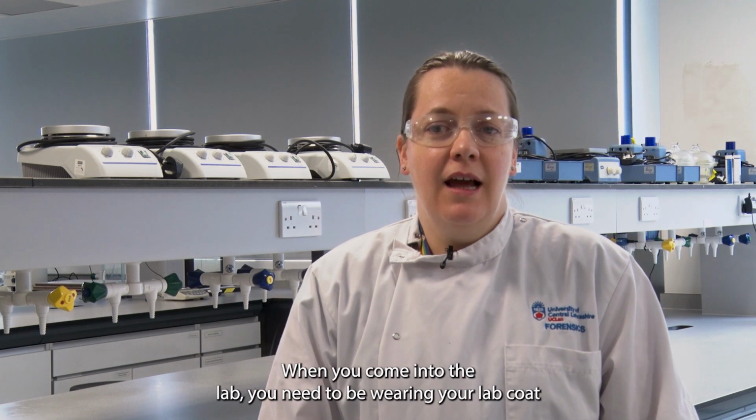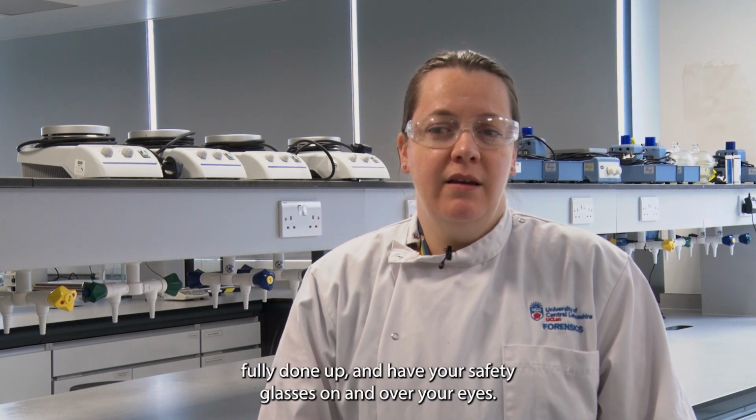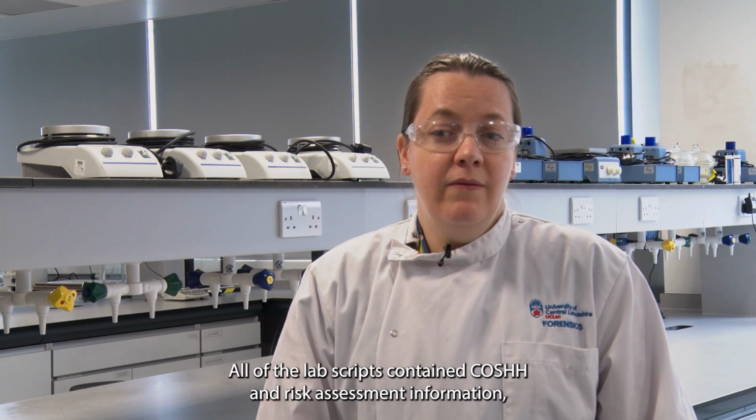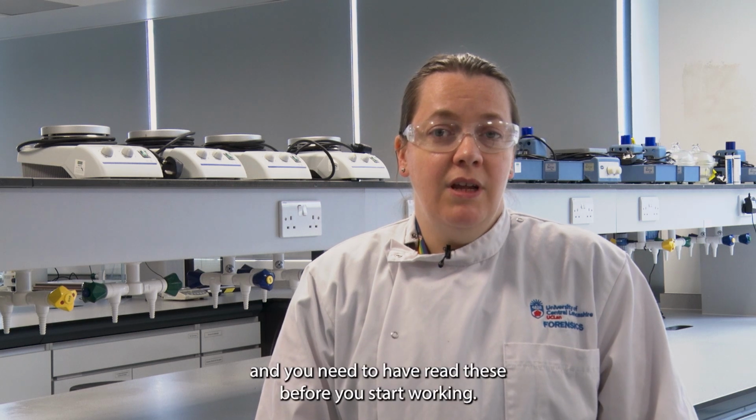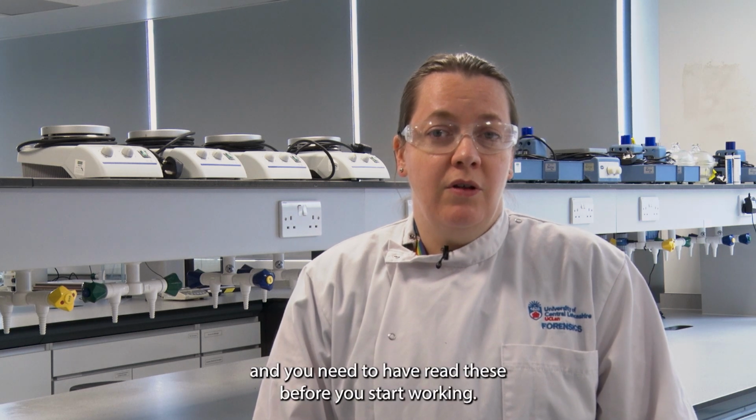When you come into the lab, you need to be wearing your lab coat fully done up and have your safety glasses on and over your eyes. All of the lab scripts contain COSH and risk assessment information, and you need to have read these before you start working.